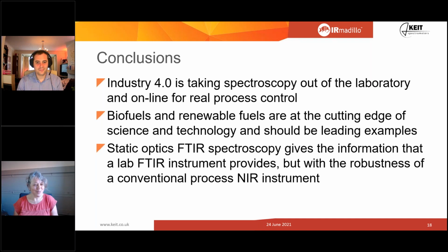Thank you. Next question. For products that use FAME as raw material, sucrose esters for example, is it possible to use the IR probe to measure the consumption of FAME? Yes, 100%. You can measure that. You would be able to watch it consuming over time. You can then look at rates of consumption and kinetics, or if you're just trying to maintain a steady level of feedstock.